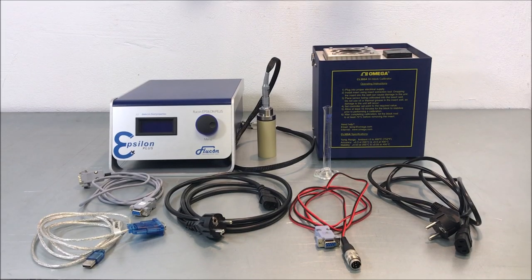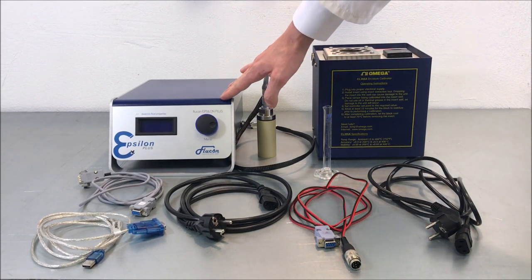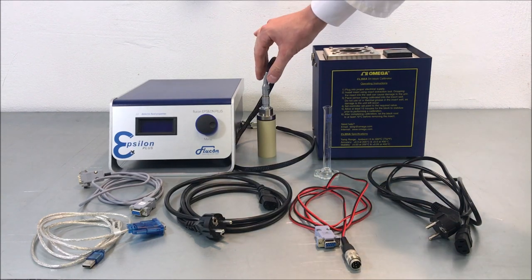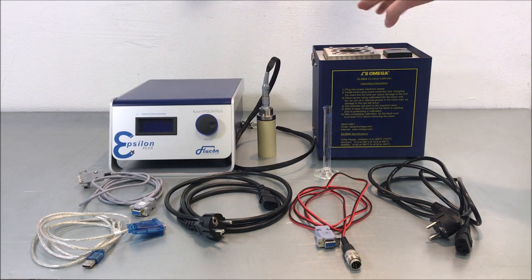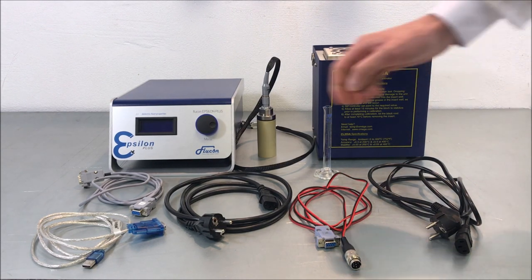The following components are included in the scope of delivery of your Epsilon Plus Dielectricity Meter. First of all, you have your electronic box as well as the sensor with the stainless steel screw-on sample cup and a heat-resistant adapter sleeve. For automatic temperature control of your samples, you have a dry block thermostat.